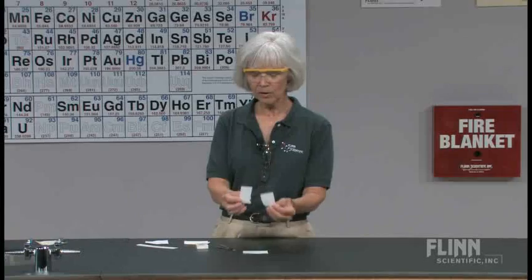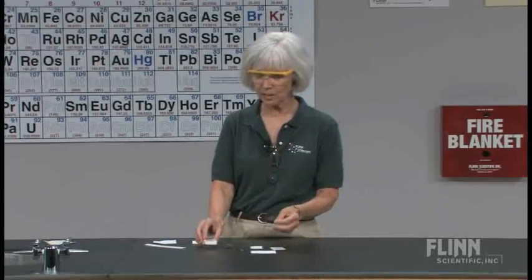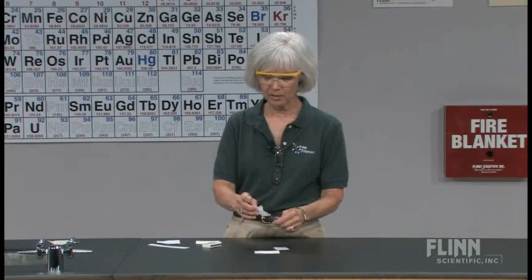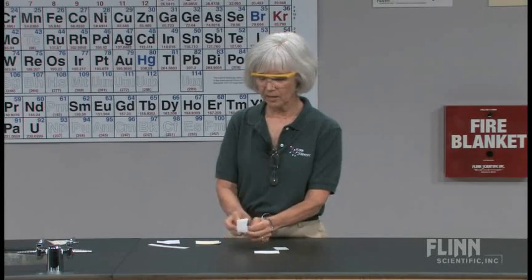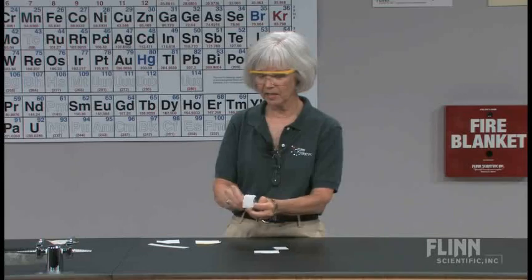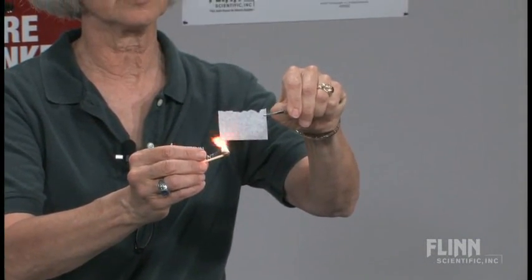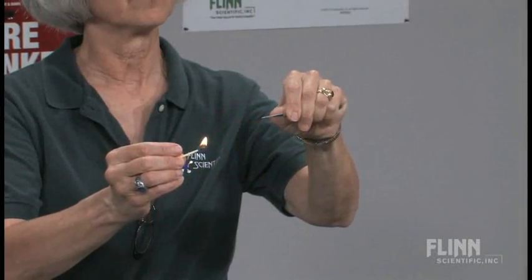Let's bring a match to it. Now, I will readily admit that my students think this could be really boring, so some of them are not paying close attention. I'll strike a match, I'll bring it to the paper, and the paper will disappear.